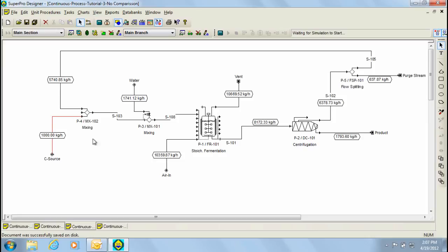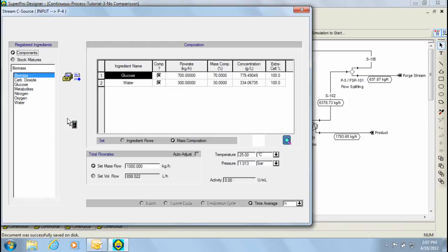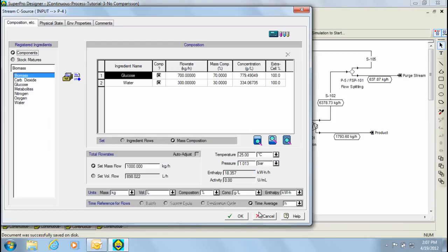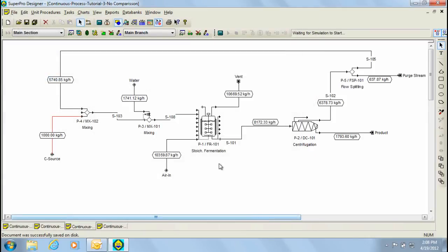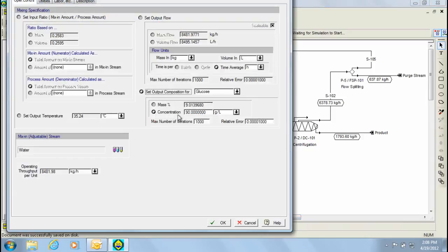To start, a concentrated glucose solution is added. However, this feed is diluted using a custom mixer to a concentration of 90 g per liter of glucose. Notice that the custom mixer not only has the option to achieve a target mass composition or concentration, but also mixing specifications can be specified in various ways.